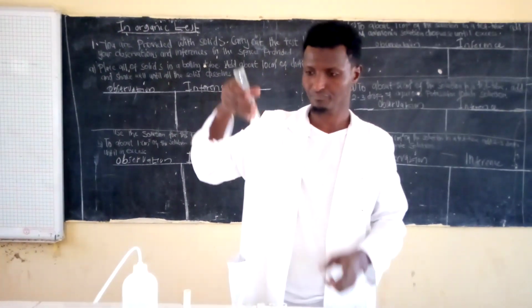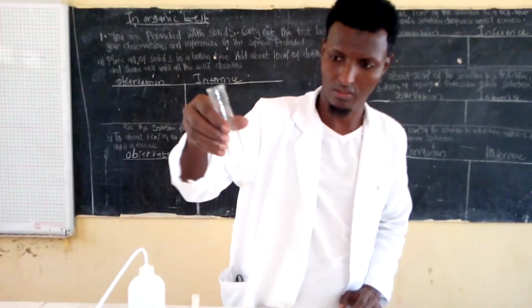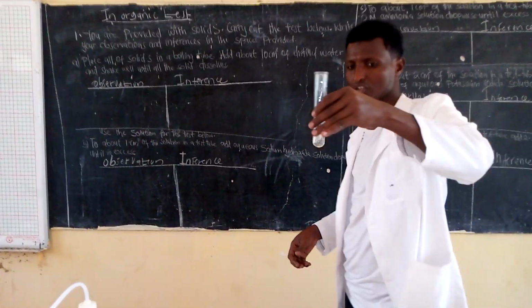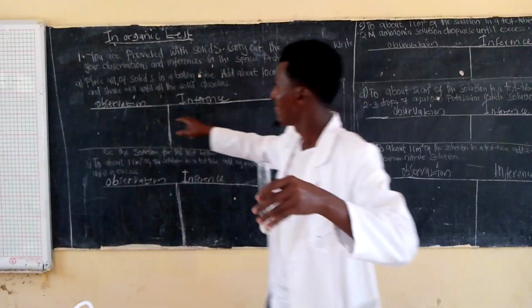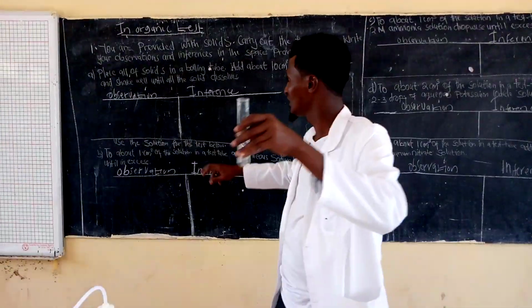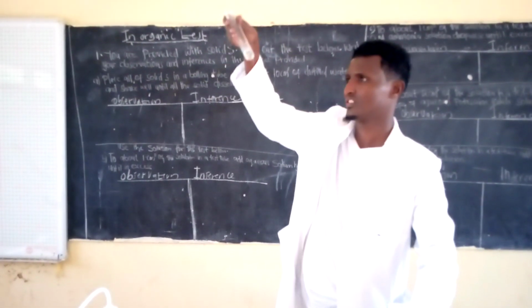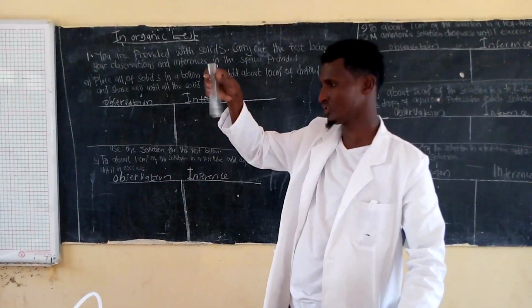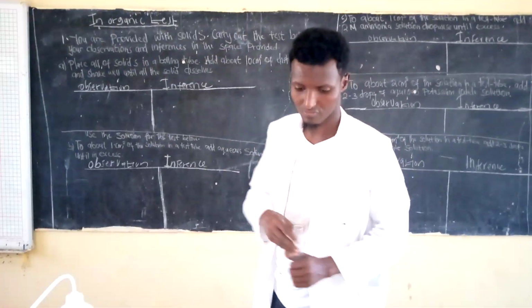Now we shake well until all the solid dissolves. Now our solid has dissolved.